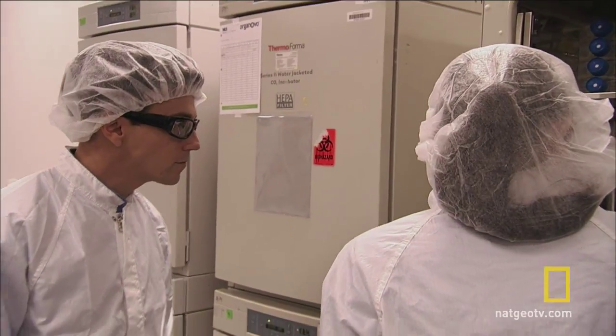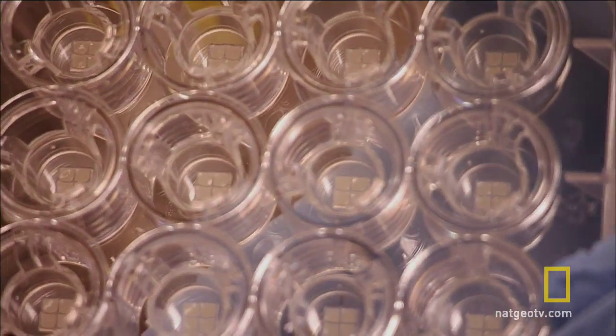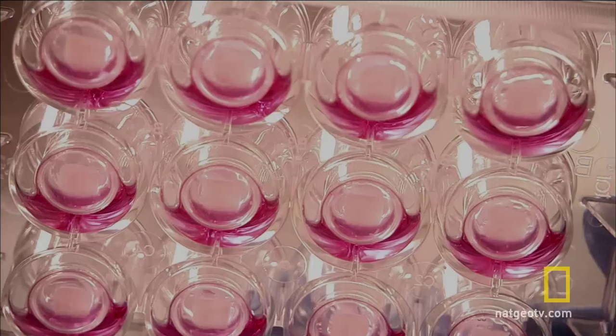We can see tissues that we actually printed yesterday that have been incubating overnight. So from print to incubation to culture in 24 hours. This is now ready to go for toxicology studies or beyond.